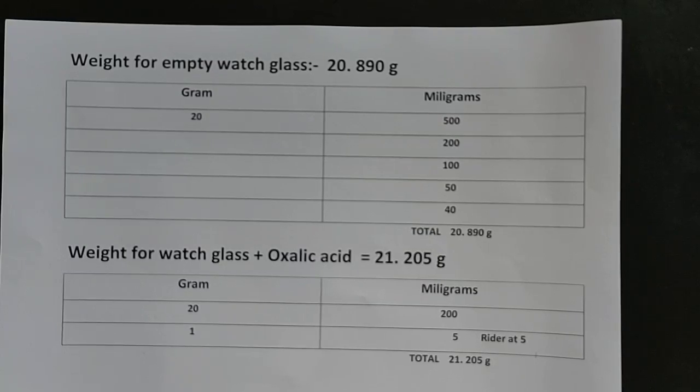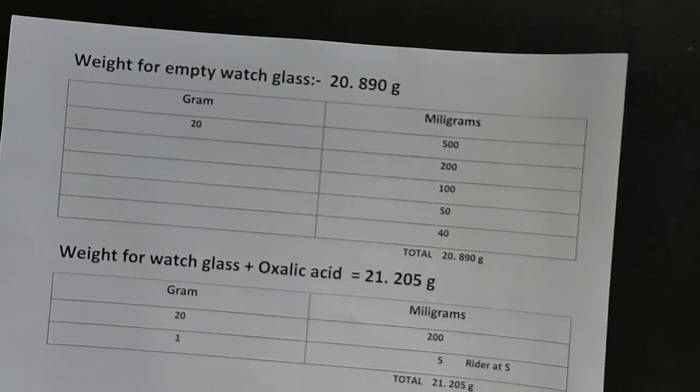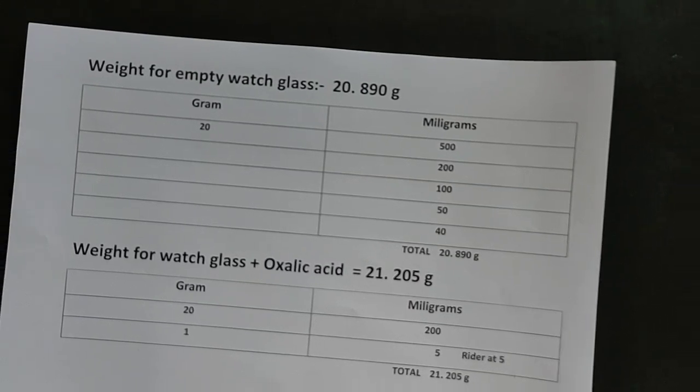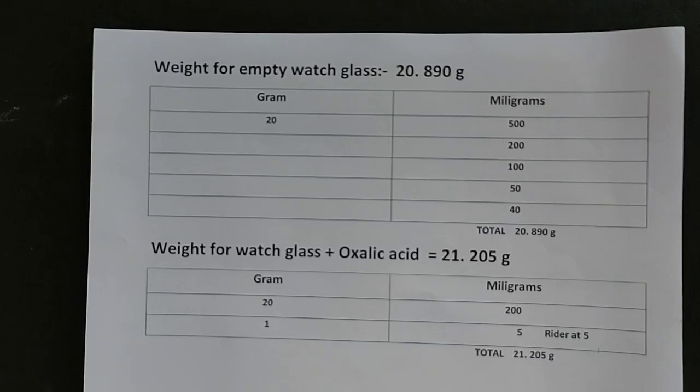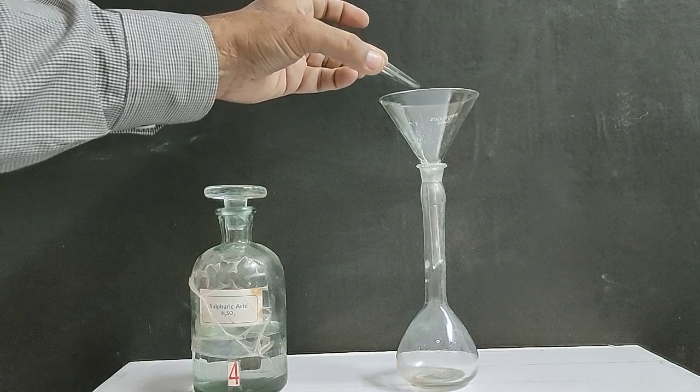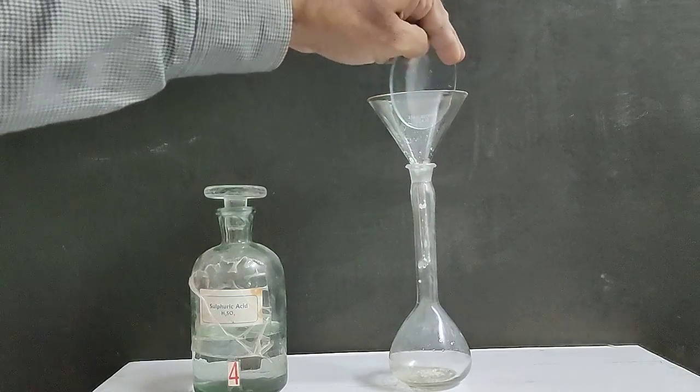Our observation: empty watch glass weight, watch glass plus oxalic acid weight. Transferring oxalic acid into volumetric flask.